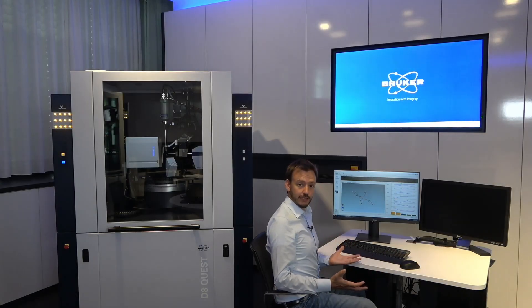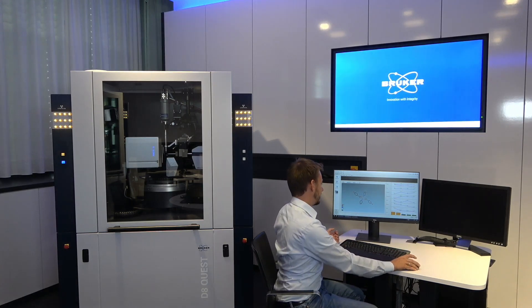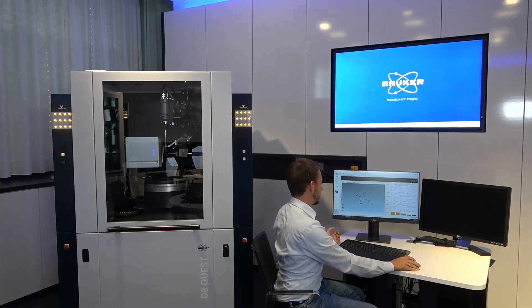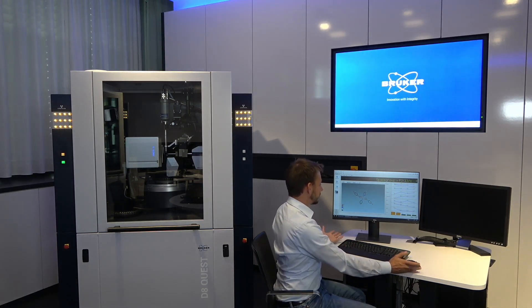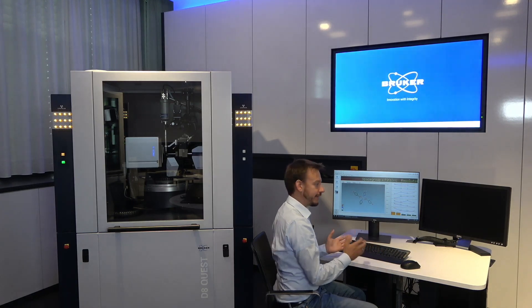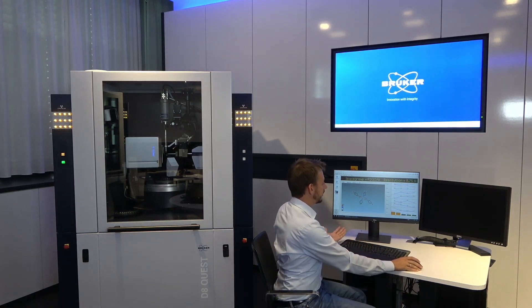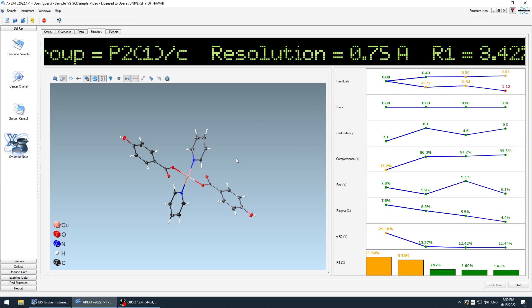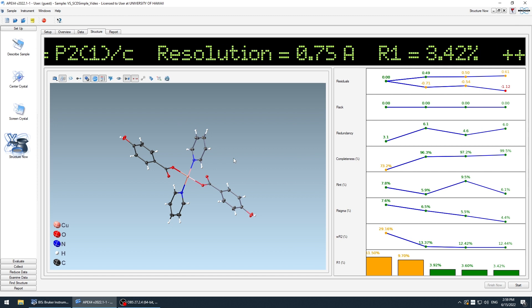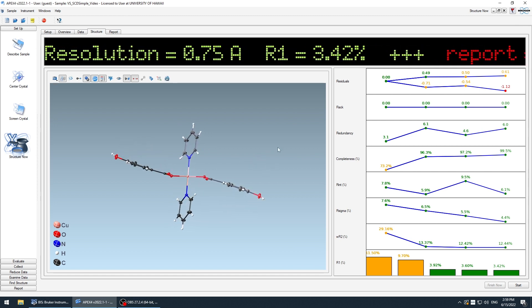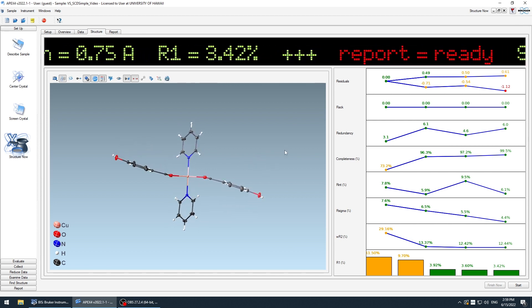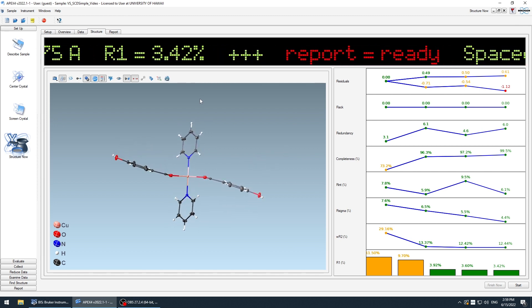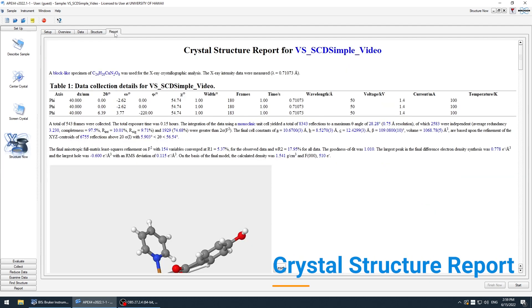The data is already good enough. So let's have a look at the final report. The software compiled all the remaining data and created a report. Already from the statistics, you can see it's an excellent data set, an excellent structure model without any effort from my side. Everything that has been done is summarized in this report.